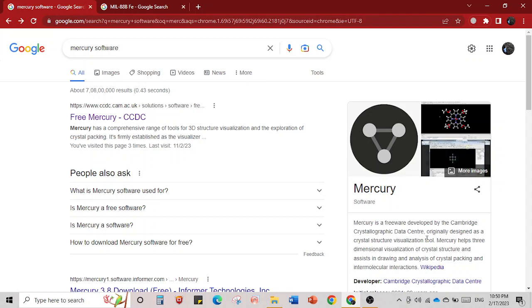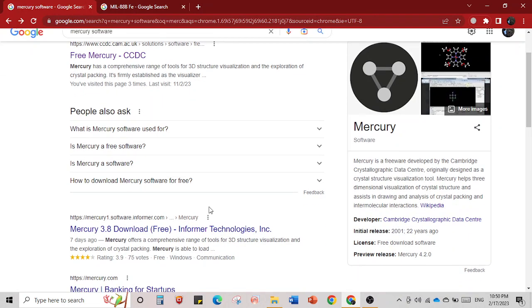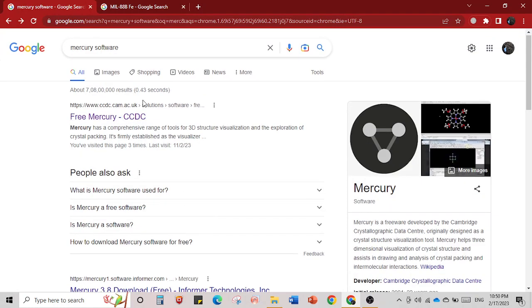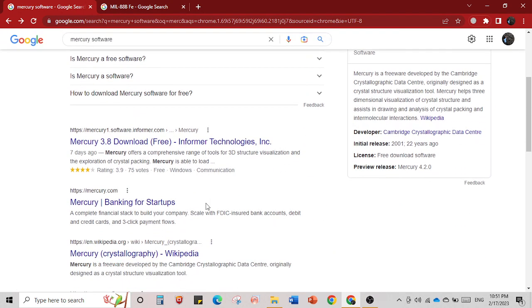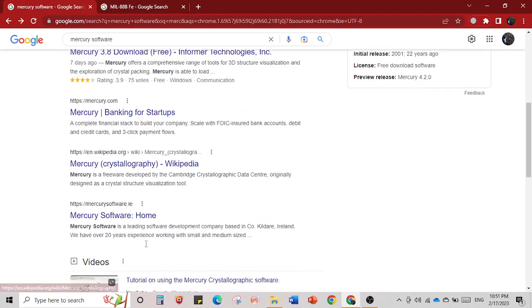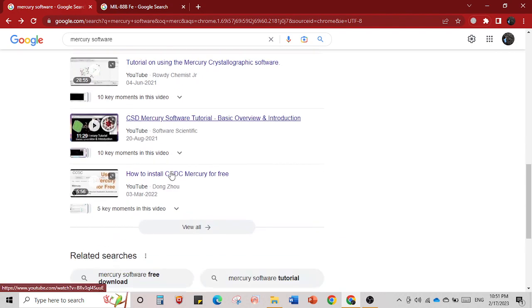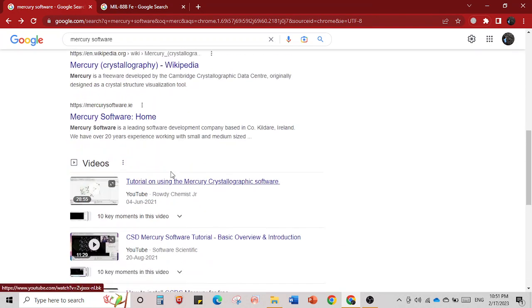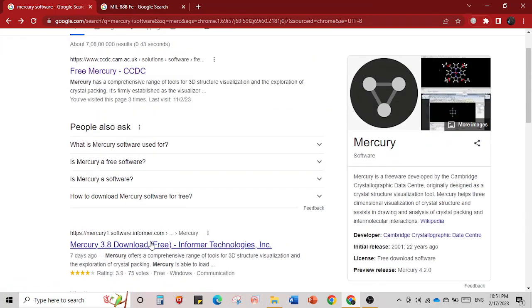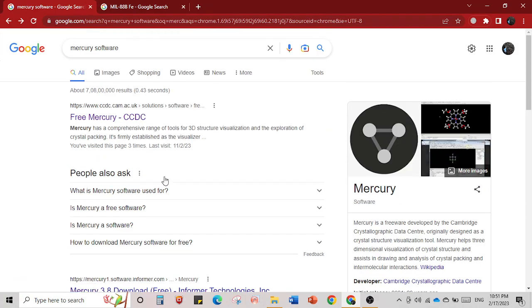There are other visualization tools also, but this is officially from the Crystallographic Data Centre so it has a lot of information and is very easy to use. Please do not download any other version of the software from other sites. The CCDC site is the official site — there are other different websites like mercury software dot ie — but none of these are original; only from CCDC is the original.